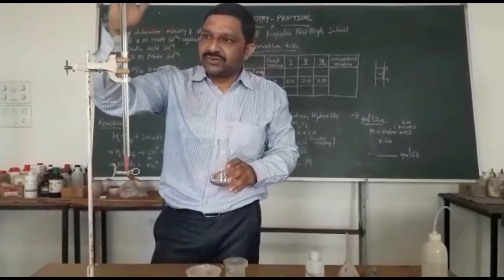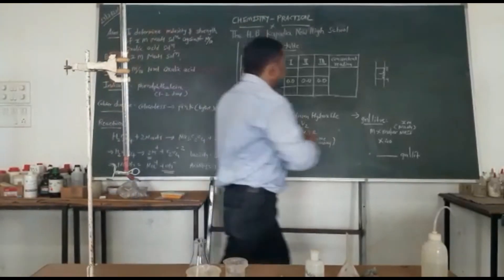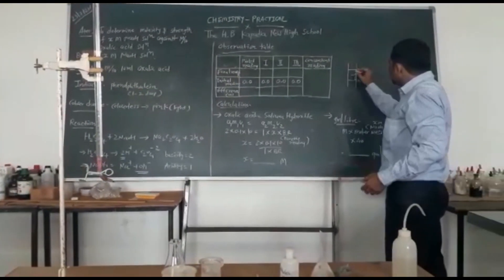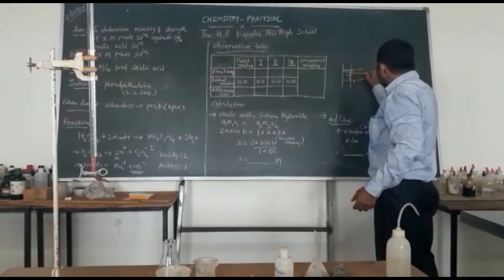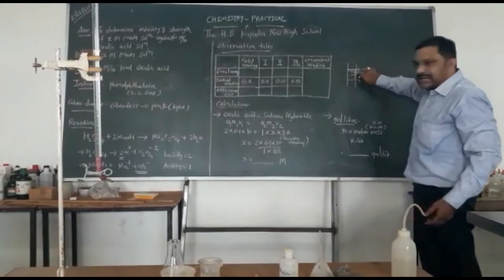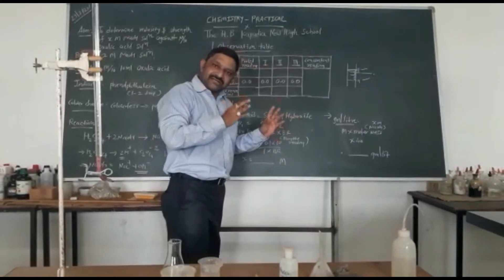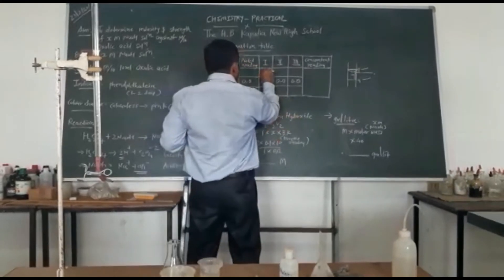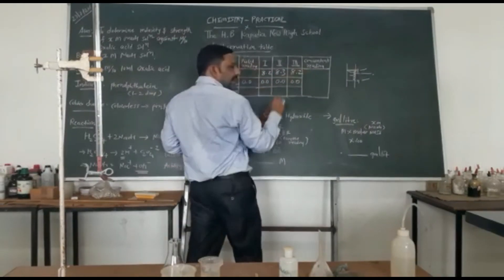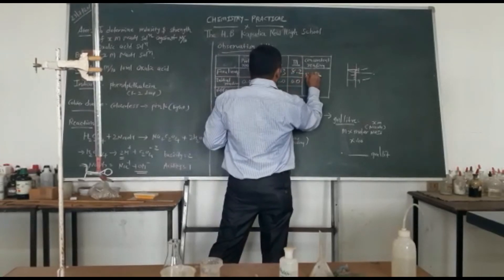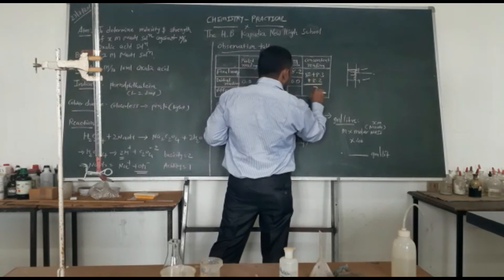Light pink color has appeared. Take your reading from the burette. The reading is between 8 and 9 — it reads 8.2. You have to take 3 readings this way. For example: first reading 8.2, second reading 8.3, third reading 8.2. Your concordance reading is (8.2 + 8.3 + 8.2) ÷ 3. This is your titration method.